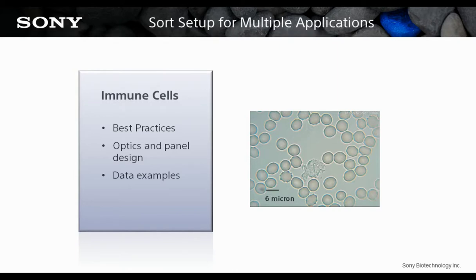Now let's look at the kinds of topics one encounters when sorting immune cells with many subpopulations.